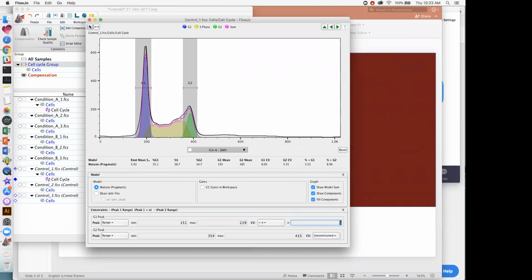If we go back to 7, we start to decrease it just ever so slightly. So whether you keep it at 8 or at 7, at this point it's really a matter of semantics. And I would say that a little bit wider of a CV here, at least to my eye, is a little bit more pleasing. And so I'm going to keep it there at an RMS of 3.4 and the CV at 8.